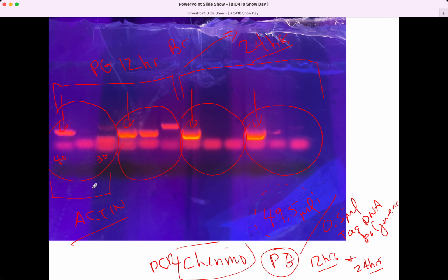Okay? All right. So now let's move forward. We have 2 Chinmo primer pairs that we have tested and seem to work well, and we like to use the 2 because it's nice to have 2 independent tests of the same thing, and you'll see there are reasons for that. The other thing to say is that the 2 primers are designed against different parts of the gene, different exon spanning primers, and that could be interesting because it can give us somewhat different results based on something called alternative splicing. It could just happen.